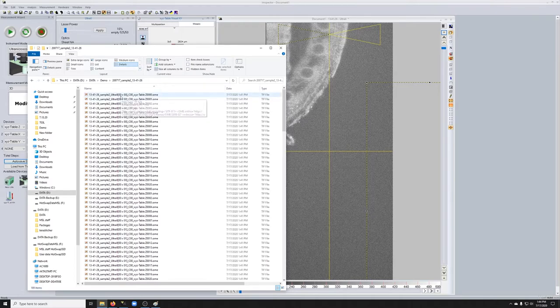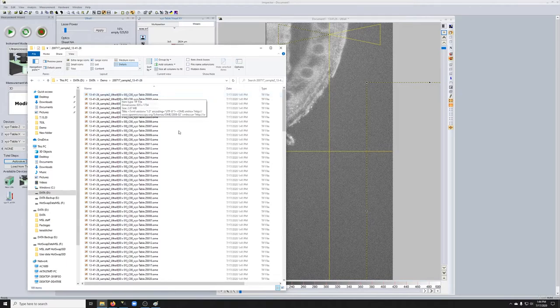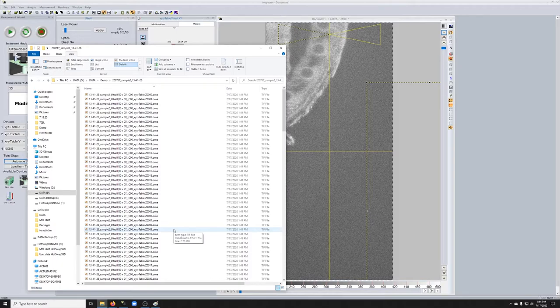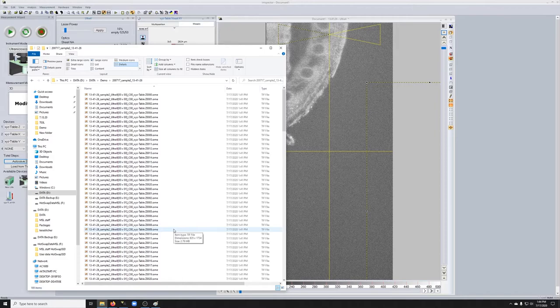Now, the good news is all of this can be converted to Imaris files, which can then be stitched with Imaris stitcher. So I will put a link to a video that shows you how to do that. So you can see what the workflow would be after stitching.